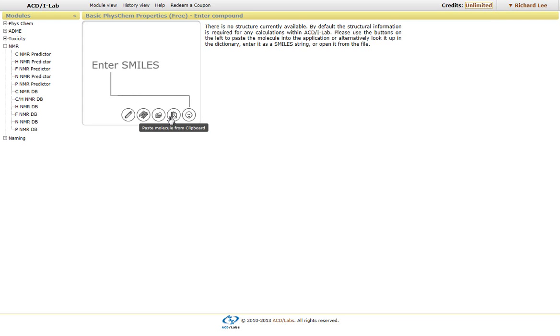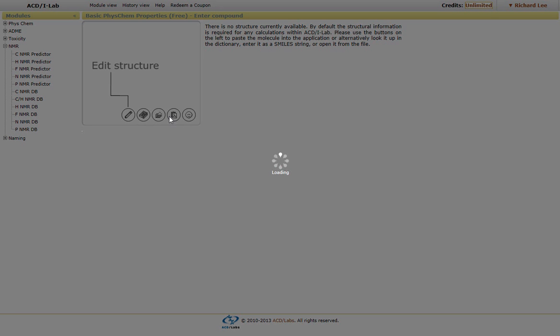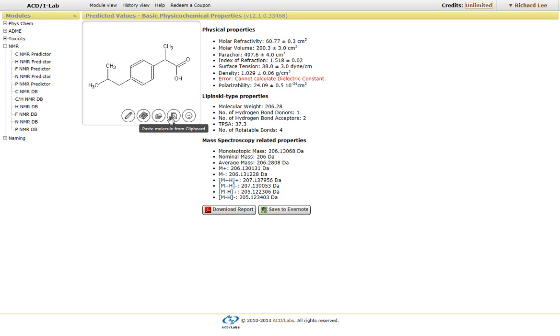In this case, I'm going to paste from our clipboard. And as soon as you paste in the clipboard, you'll notice that it generates some basic PhysChem properties.